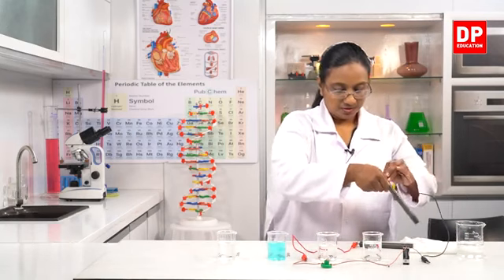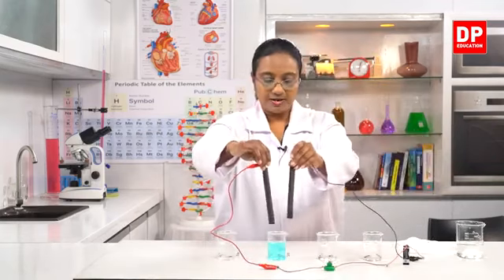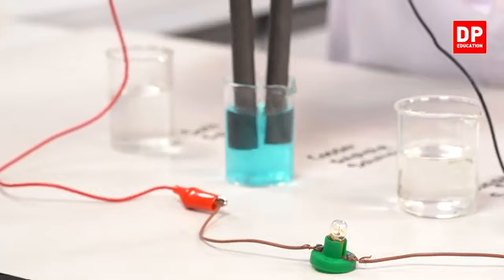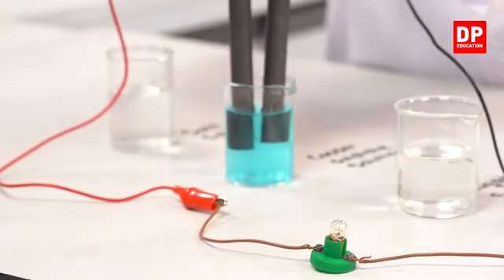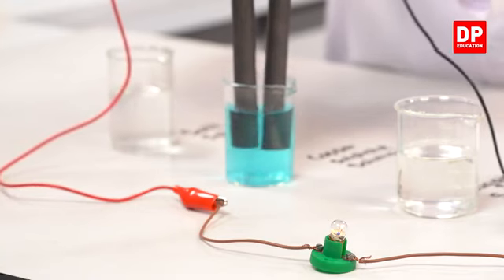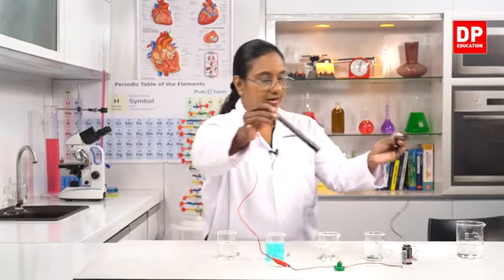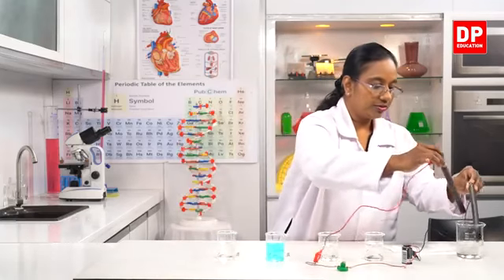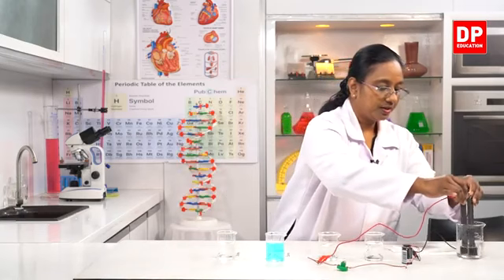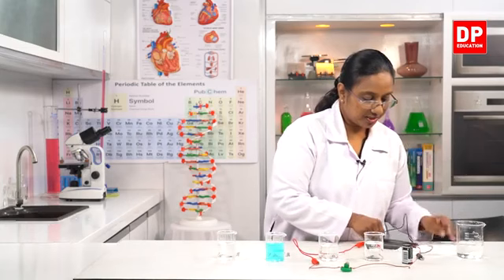Okay. So again I will insert it into the copper sulfate solution. Can you all see the bulb now? The bulb is lit. So that means copper sulfate conducts electricity. So then again I will have to wash the 2 electrodes in distilled water, and we have to dry it.